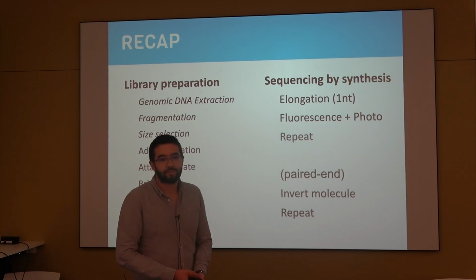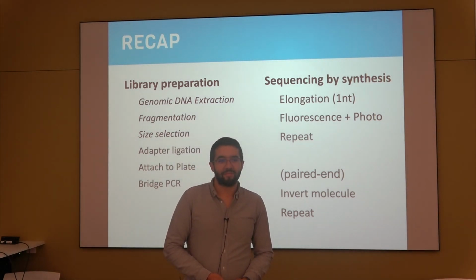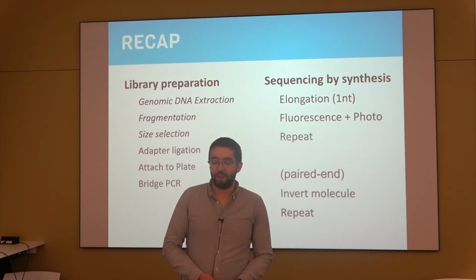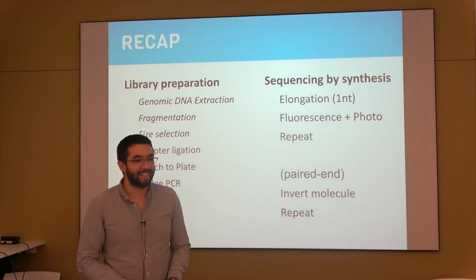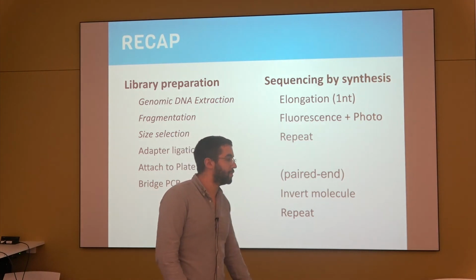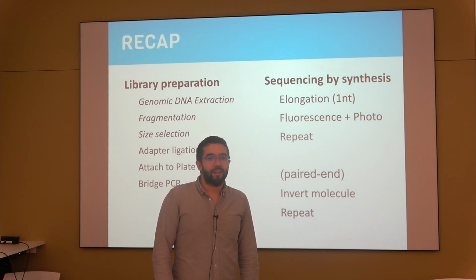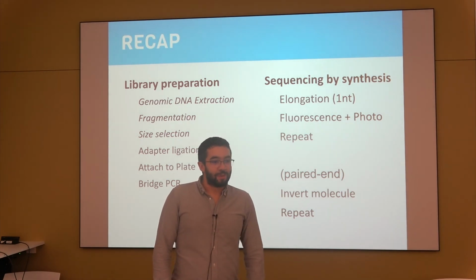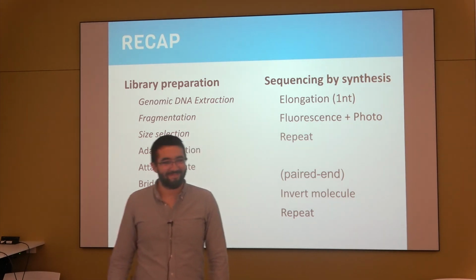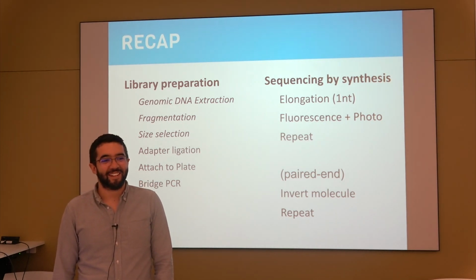There are also robots that can do all of it, but that's only for industry labs. If you have a very standardized pipeline, you can automate most of these steps, yeah, all of them. Taking the sample is always done manually. We hope. Yeah, for now.